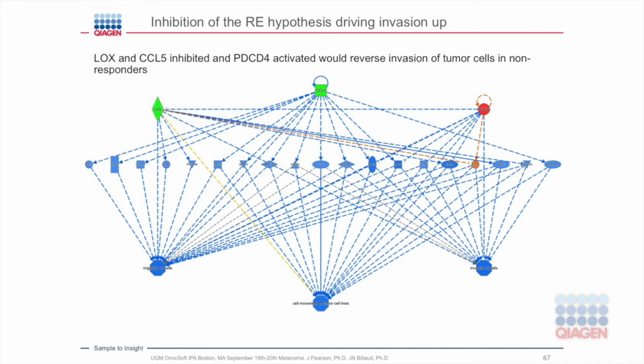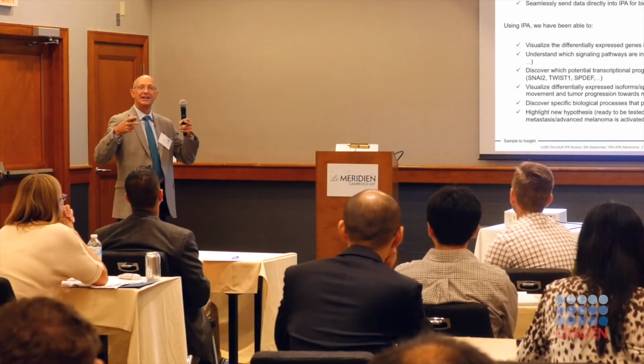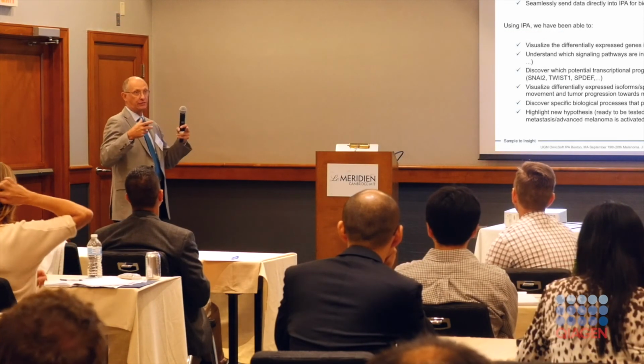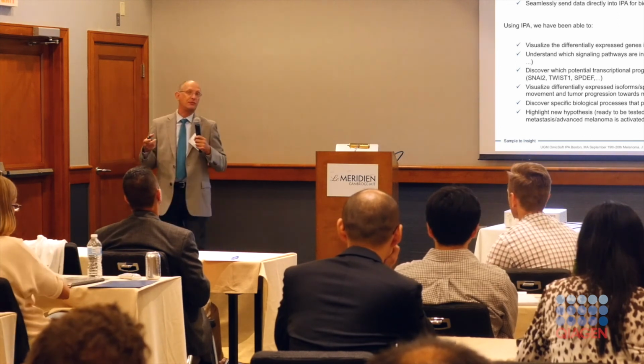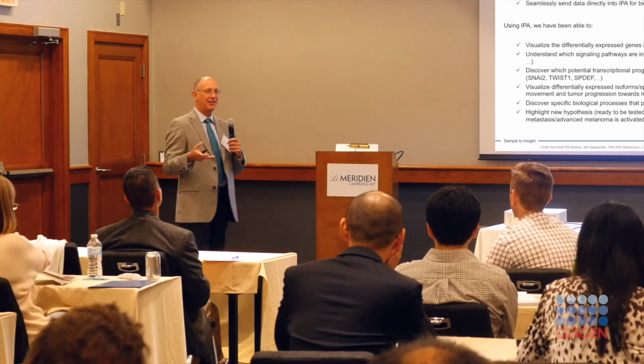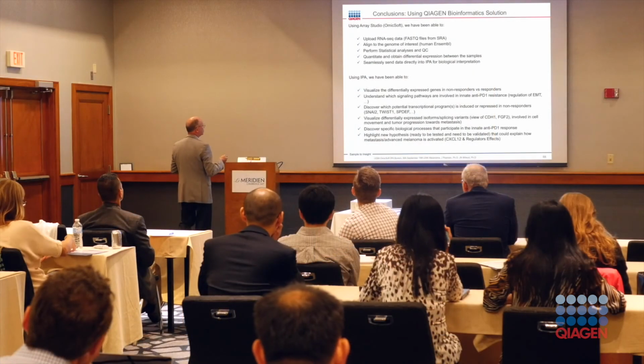So I went a little fast, but this afternoon I will be pushing a little further to really show you how we are integrating, actually, IPA and Omicsoft at a very powerful level. I'm new to Omicsoft. I knew Omicsoft 6 months ago, and I think we have achieved a lot, and this is just the beginning of a very strong connection here.